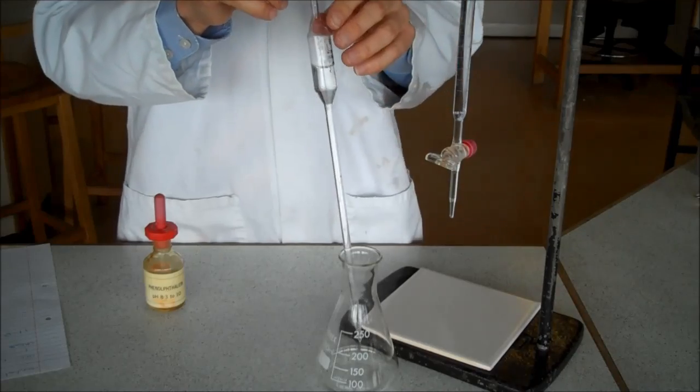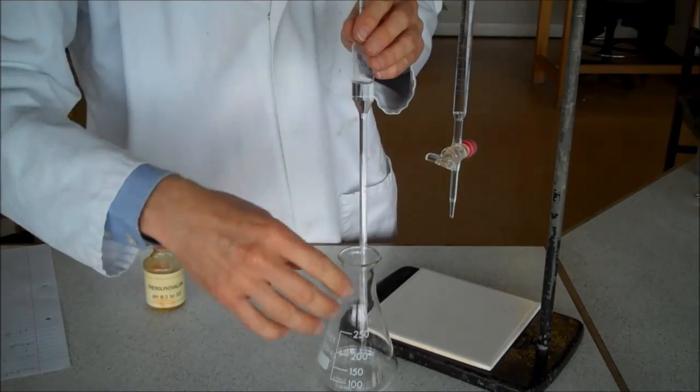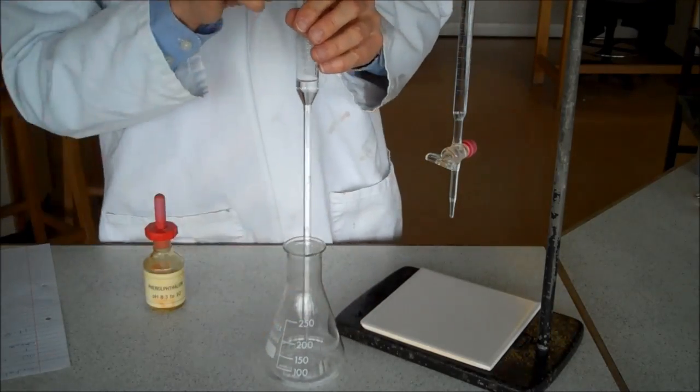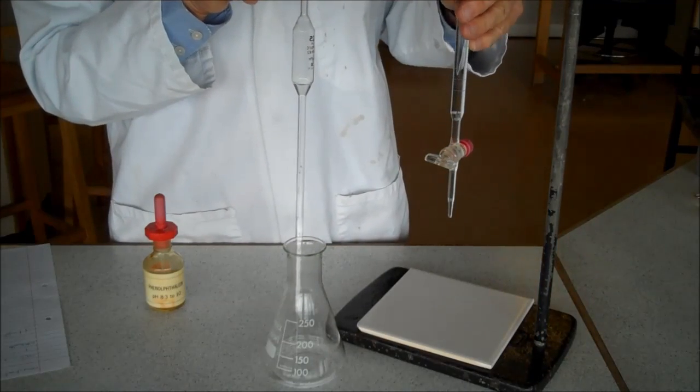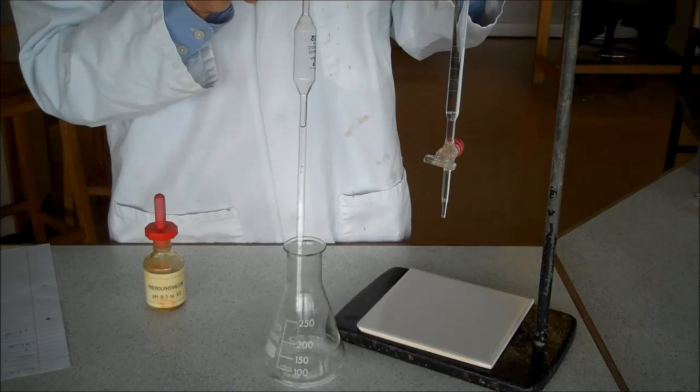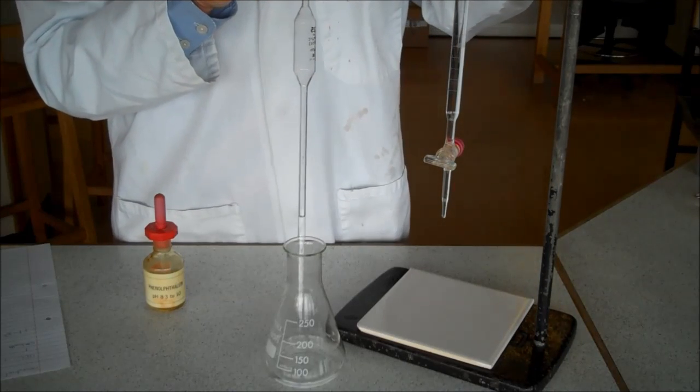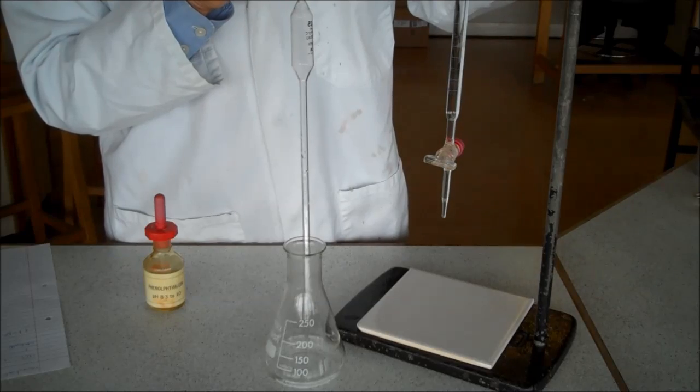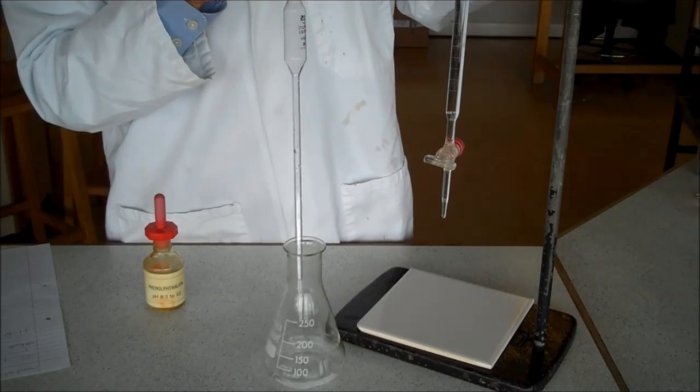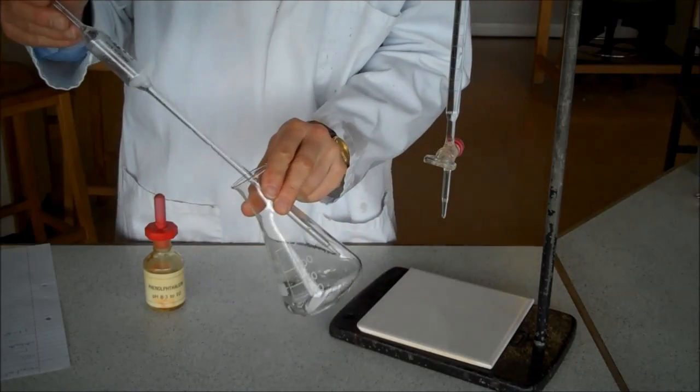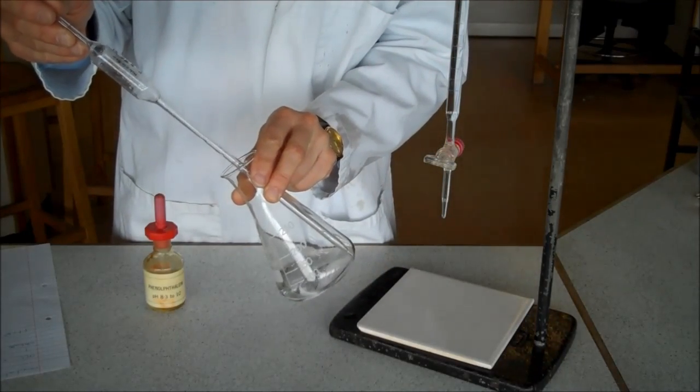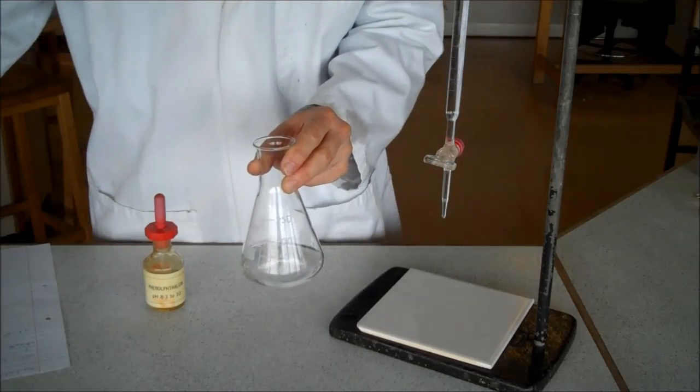In my burette, I put some hydrochloric acid. I've done that beforehand, but that hydrochloric acid in the burette is what I know the concentration of. In this instance, the concentration is exactly 0.1 moles per decimetre cubed. We're going to use that to work out our concentration of alkali.